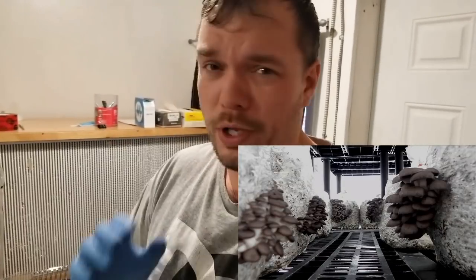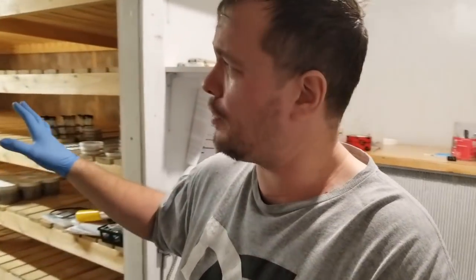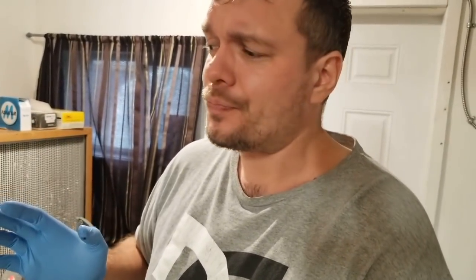Just let me know what's going on with your culture library. Keeping cultures healthy and expanding out to production — it's not really that complicated, but it does take good technique. I like to do everything in this lab. This is lab one, which we use primarily for our spawn and cultures, but we'll use it for overflow production if we need the space. Hopefully you guys found this helpful. If you have any questions, leave them in the comment section below. This is our process — it's pretty standard, but there's obviously lots of different ways to do it.